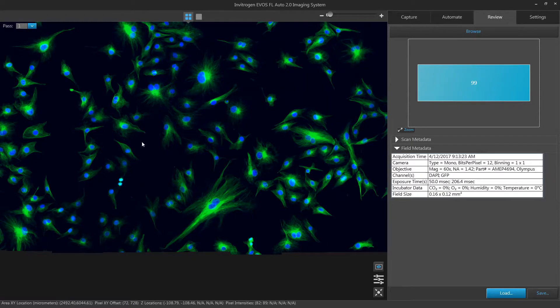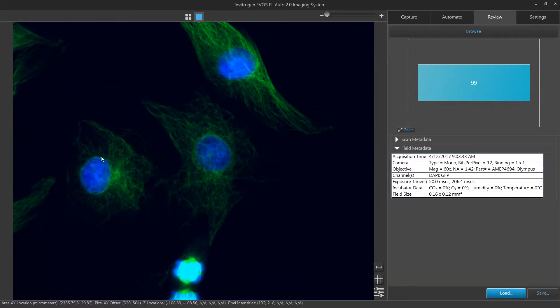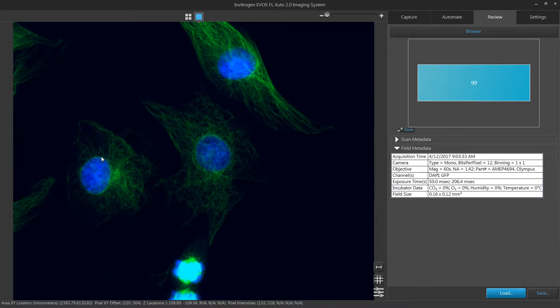To look at a specific field, double left click on your field of interest to move to your field location with your selected image.